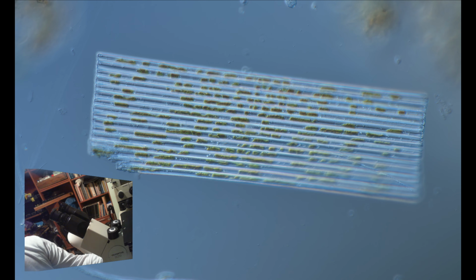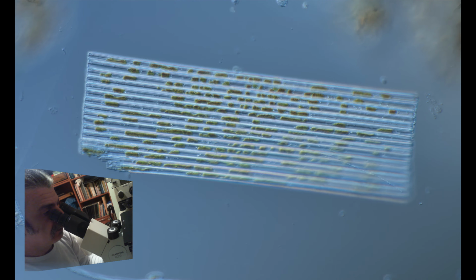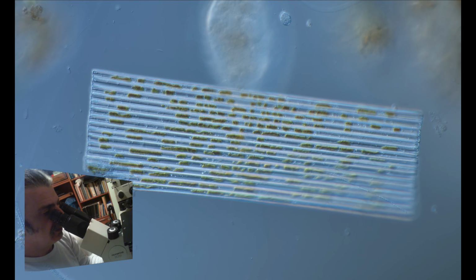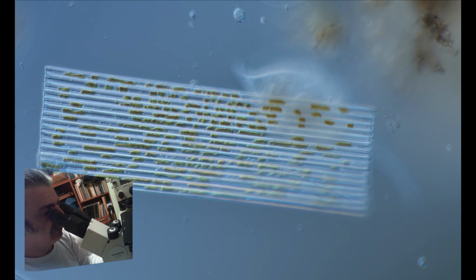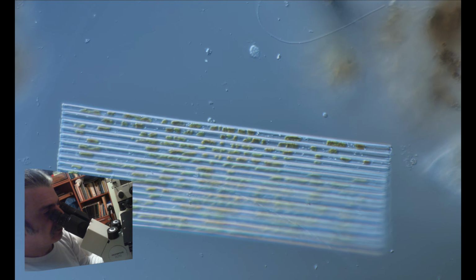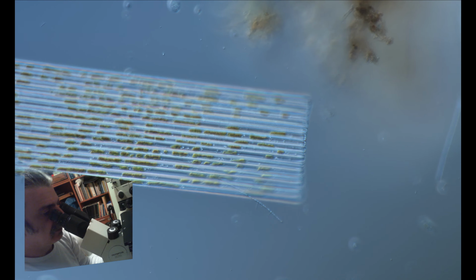Okay, so here is a nice diatom mat. Diatoms, I'm recalling, are algae, and those green spots in the middle are chloroplasts that house chlorophyll to do photosynthesis, and they are surrounded with a glass protection layer.